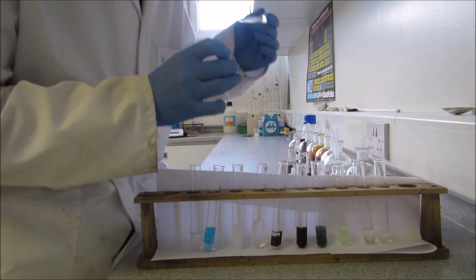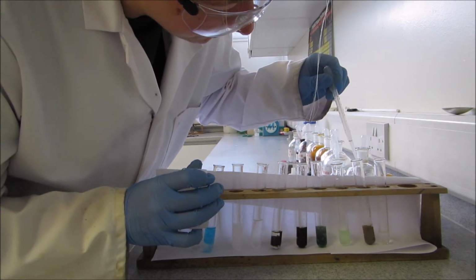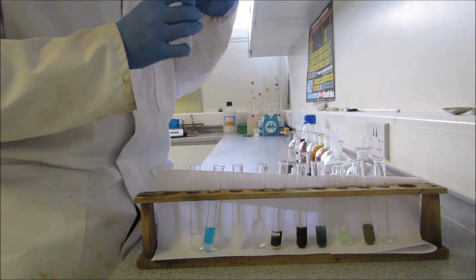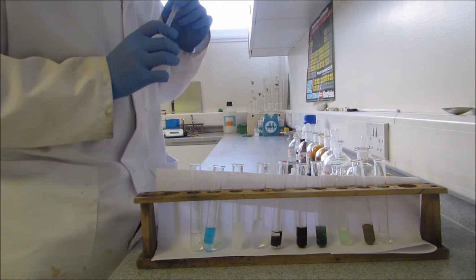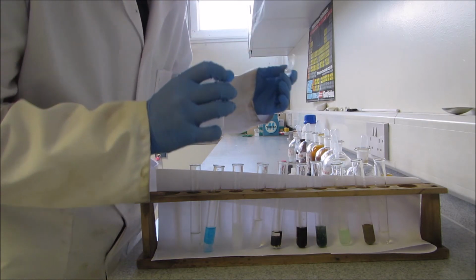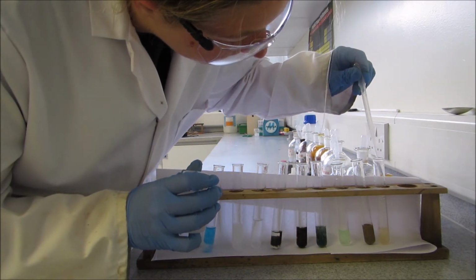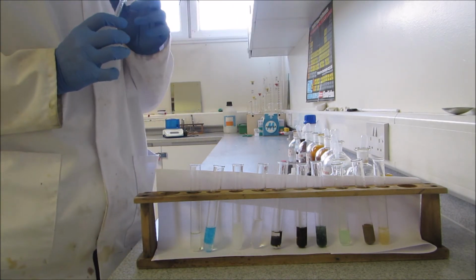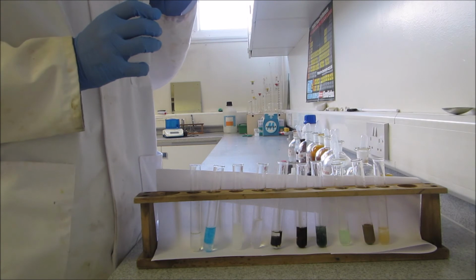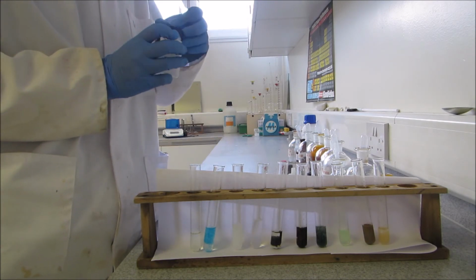Second last one is silver. So when I add sodium hydroxide, you sort of get this grey-brown colour, and that identifies it as a silver ion. And finally, the manganese cation: when I add sodium hydroxide, I get a sort of creamy brown precipitate, and again that also confirms that it is indeed the manganese cation.